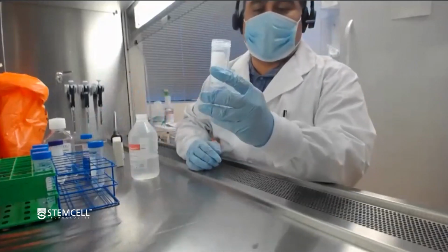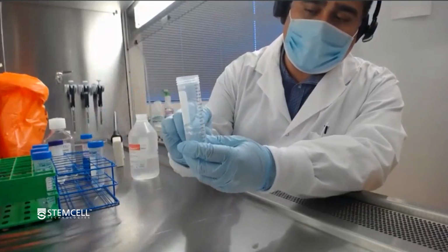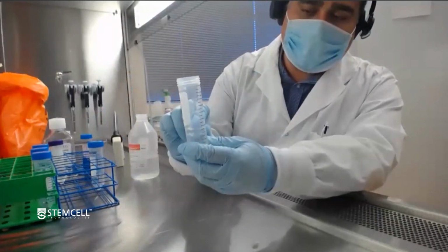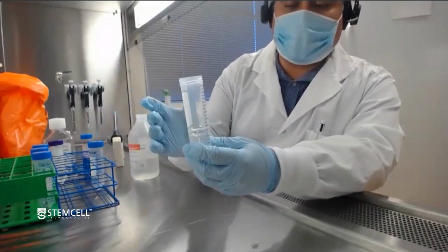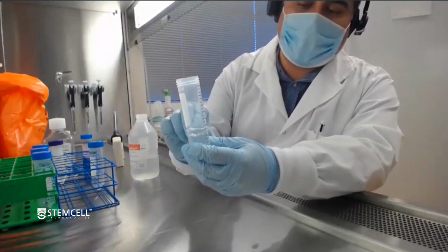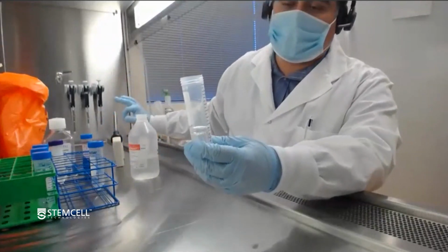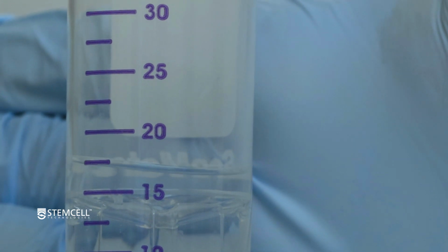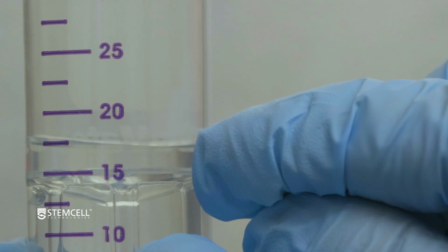What I do want to stress is the importance that you have some density media above the insert. That's a common error that some people might make, is that they might dispense just below or at the insert, but you actually want to dispense 15 mils from the graduated pipette. So you purposely want to have about 1 to 2 mils above the insert. That is important.